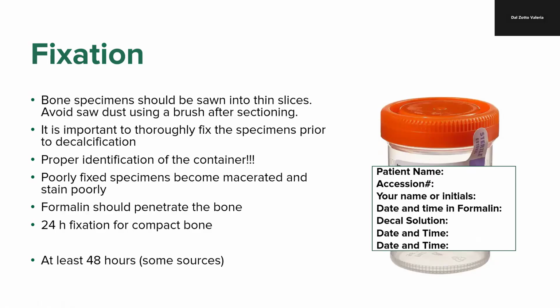You're going to go to CP or blood bank or microbiology. You're not going to be in the grossing room anymore. So proper handoff of the specimen to the resident who is taking over the subspecialty is one of the steps that you are going to learn how to do.